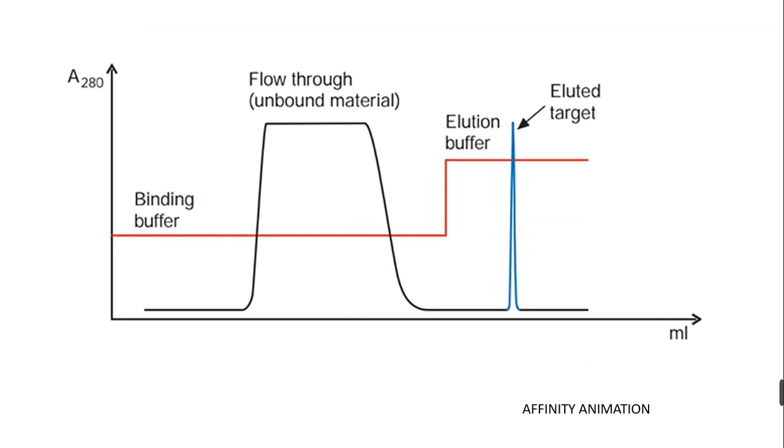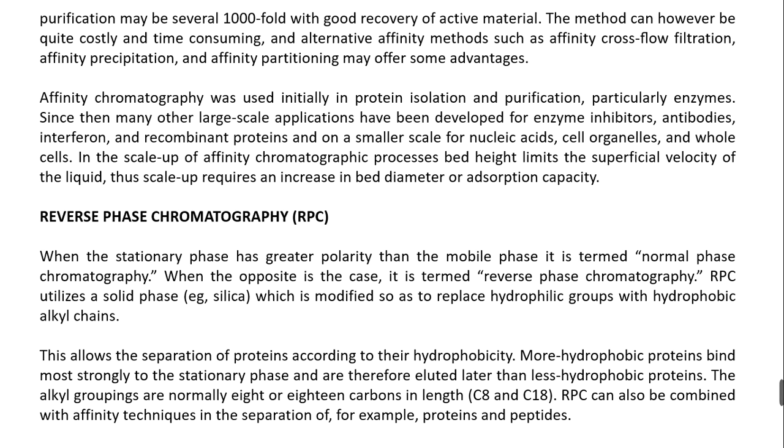This is a very important question for the examination also. This is a very high level of purification, and the purification fold can be excellent in this type of purification. However, this method can be quite costly compared to other types, and it is time consuming also, because you have to prepare the affinity ligand and the spacer arm. But once you standardize it, you can use it multiple times, no issues at all.